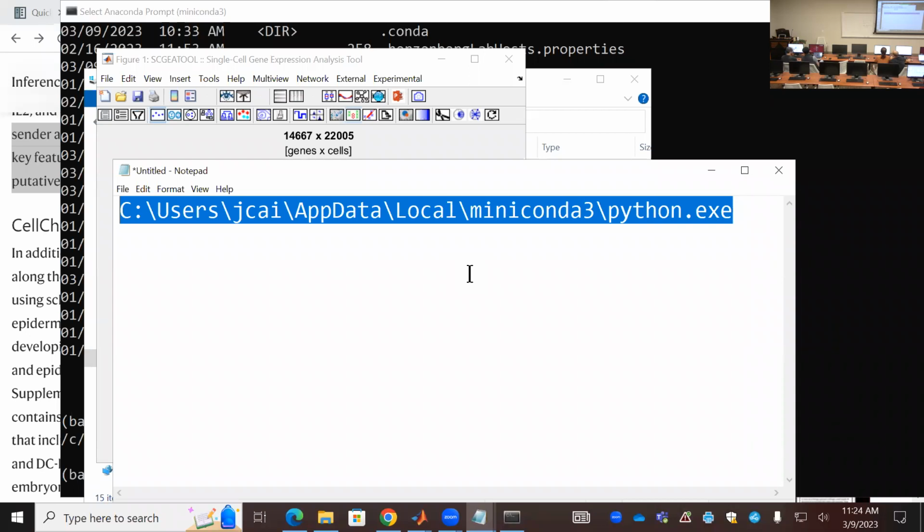Oh, okay. Yeah, local. So this should work. So that's a way you just add that. You can copy this just in case. So this should work. You should add that in, but because it's not supported, you get this problem.